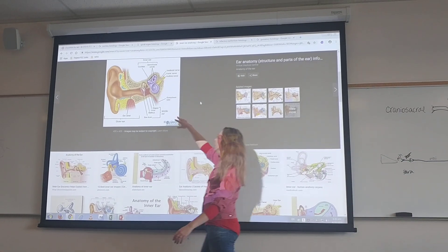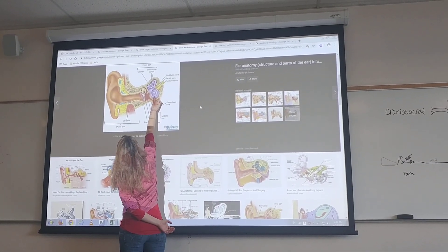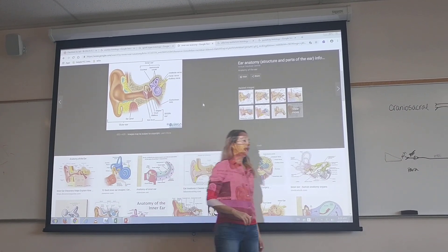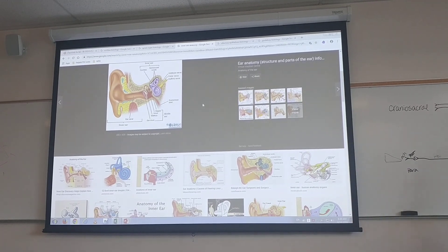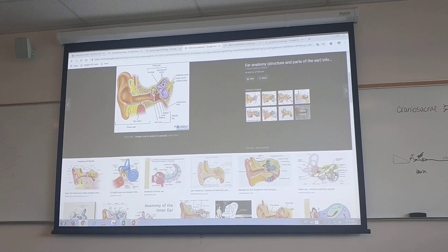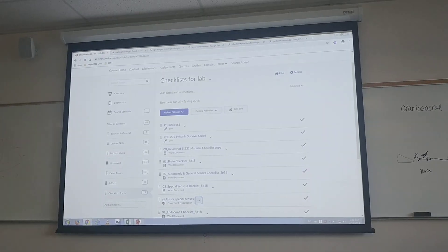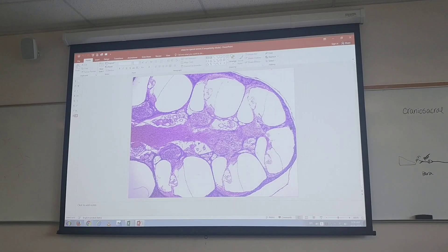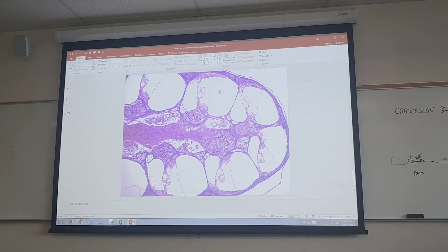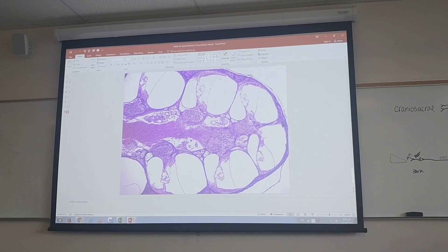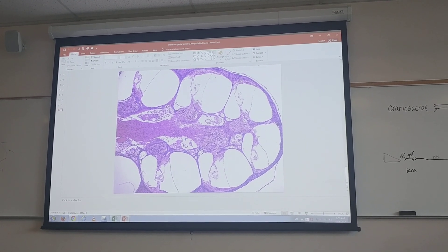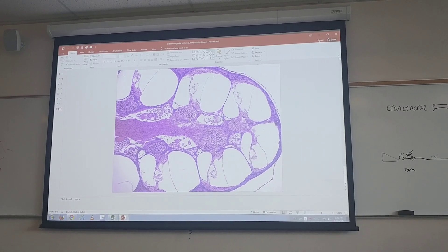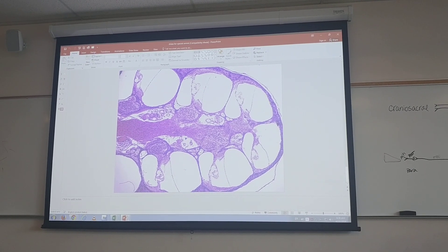We're going to move on to the ear. We're going to slice open the cochlea and look at a cross-section of the cochlea histologically. This is a cross-section of that snail shell, the cochlea. Here's one cross-section, here's another — because it's spiraling around, you're going to see a lot of these cross-sections.